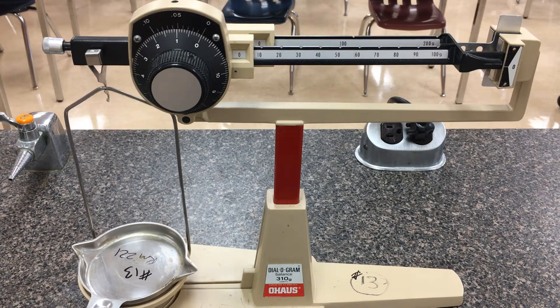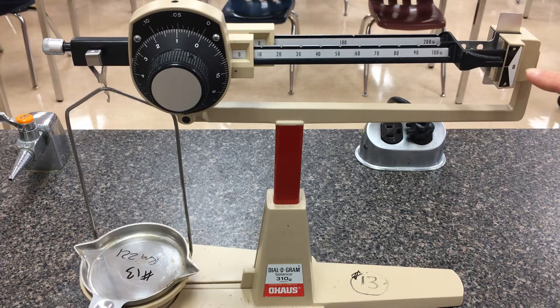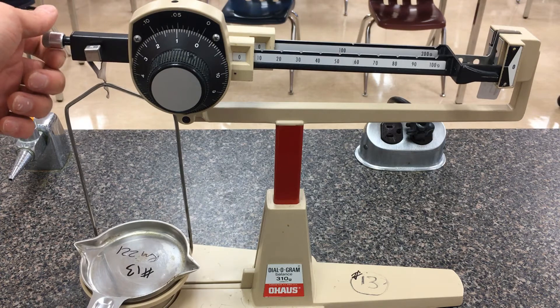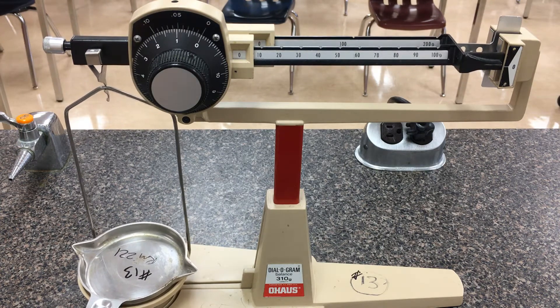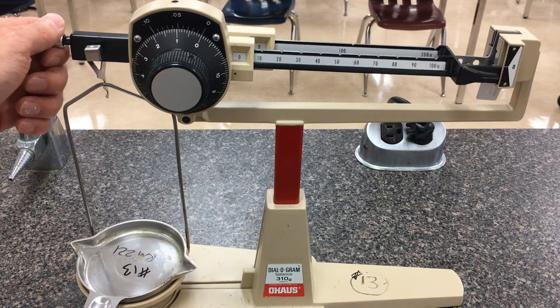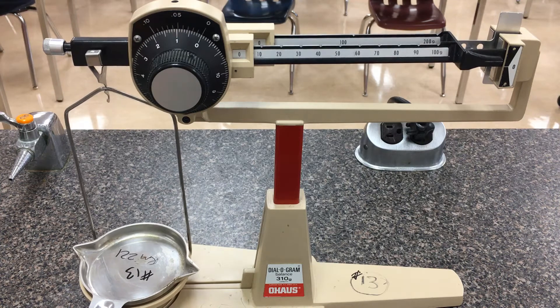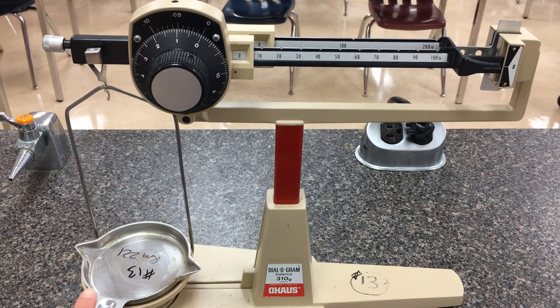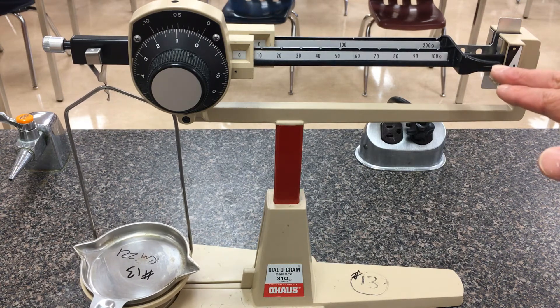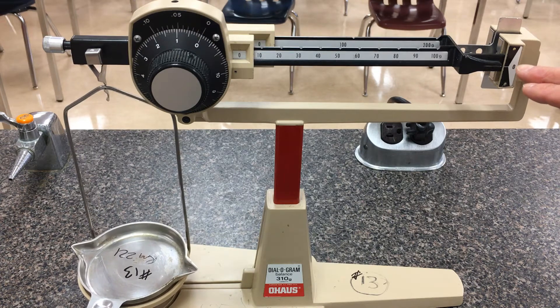The first thing you want to do, even before you put down your objects, is make sure the moving arm's line is lined up with the zero mark sticker on the right hand side. If it isn't lined up, you can dial this metal knob one way to see whether it moves closer to or farther from the mark. All these diagram scales are calibrated for their own pan, so make sure not to accidentally mix them up. The scale is calibrated when the lever arm's line is directly across from this zero mark on the right hand side.